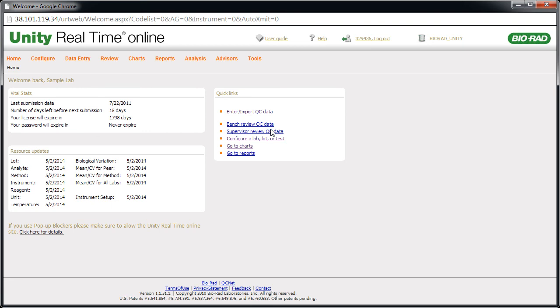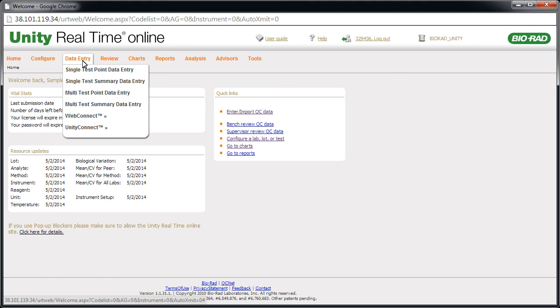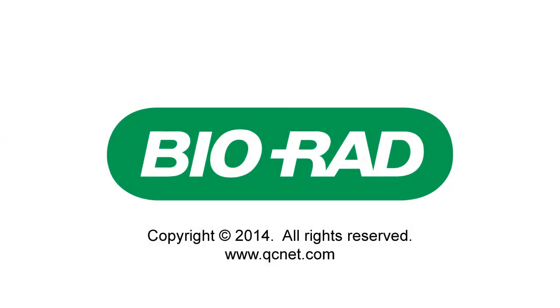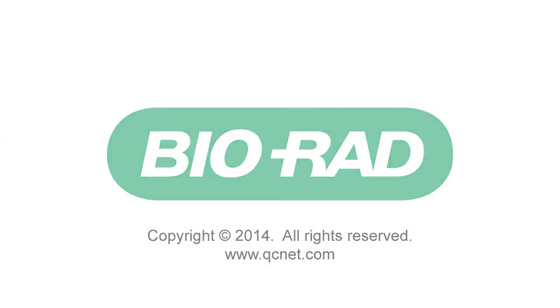Software functionality can be accessed with the menu bar. Continue your training by viewing Part 2.